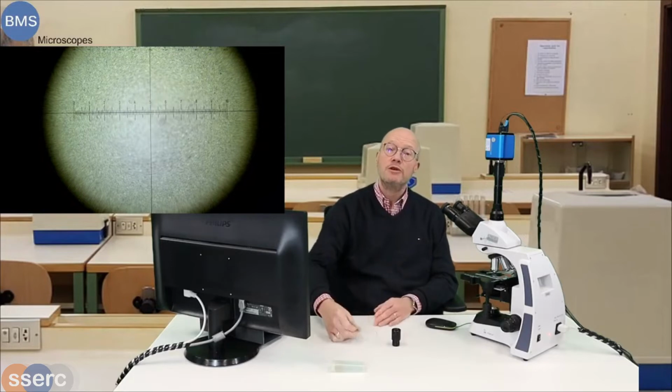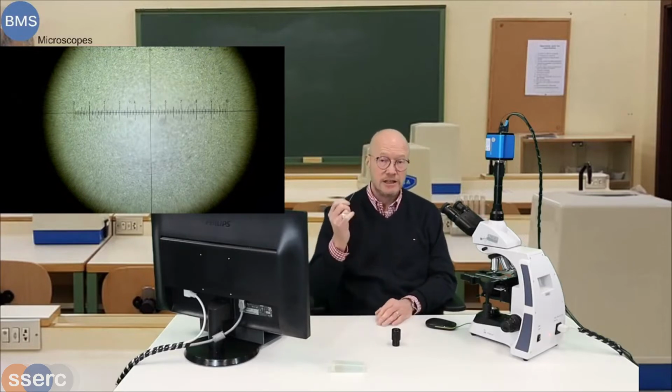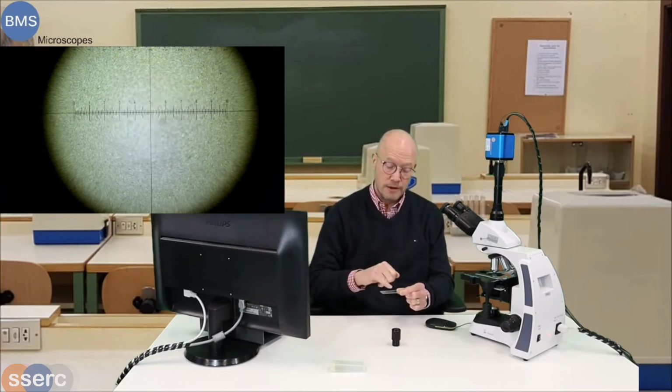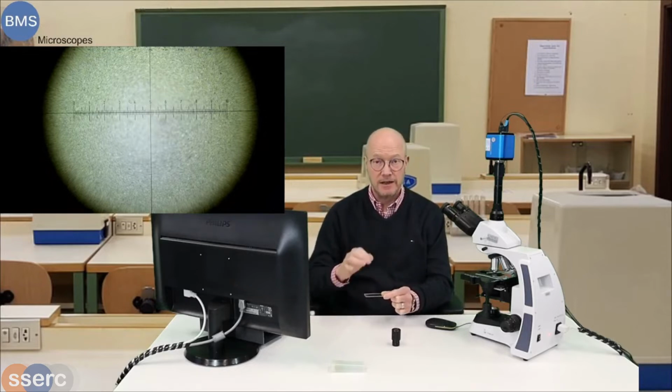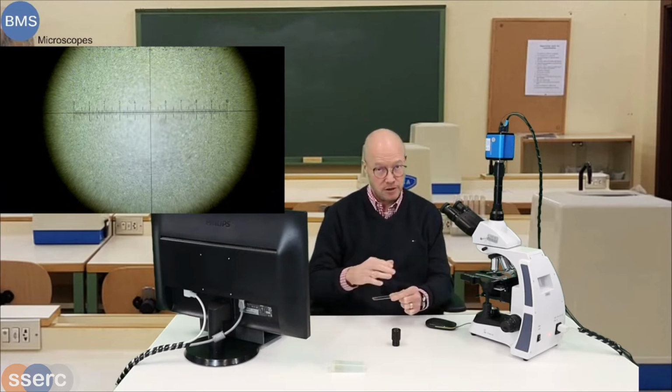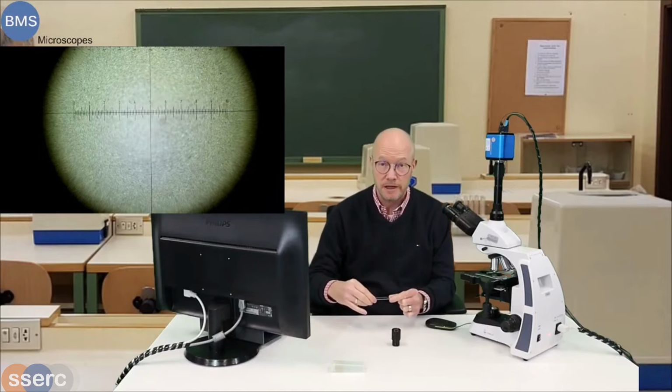To bring a proper unit to these scales, you need a stage micrometer. The stage micrometer is an object, a slide, with a small centered image, and inside that image there is a millimeter divided in 100 parts, and each part is 10 microns. Altogether 1 millimeter is 1000 micrometers.